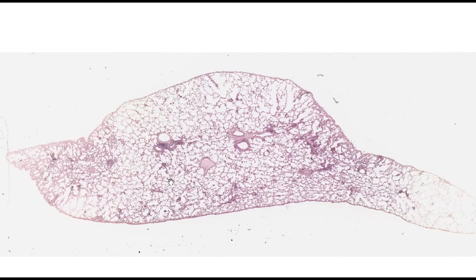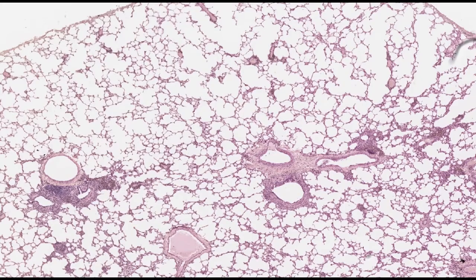At the lowest possible magnification, what we see are these non-staining areas on the outside — that's one environment — and then the organs. There might be some lining epithelia around the boundary of this tissue. And even within this tissue or organ, there are so many non-staining areas all over, suggesting external environment or lots of tubules that are part of the functional components. We also see larger circles where we should expect some lining epithelia as well. Let's zoom in and confirm.